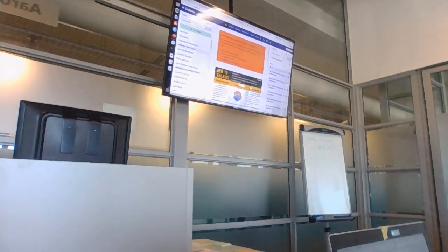Everybody's uploading, click start there, otherwise it won't. So we are now on the collections tutorial on the website.